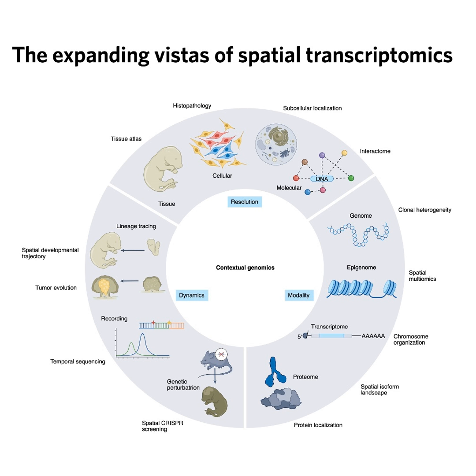How big are these spots? They're relatively large in cellular terms, maybe 50 to 200 micrometers across. So each spot captures RNA from a small neighborhood of cells, not usually a single cell. It's very robust, reliable, but the resolution isn't super high. Okay, so that's one way. What's the second category? That must be how they achieve much higher resolution, maybe getting down closer to single-cell scale or even smaller. That's right. That's what we could call the self-assembled or high-density category. This involves a range of technologies that create these massive arrays of incredibly small indexing structures. Sometimes they achieve subcellular resolution, down to the nanometer scale in some cases. How do they make such tiny things? Well, there are different tricks.